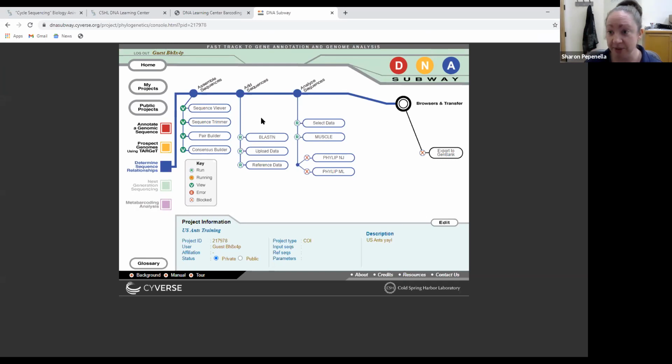Now, we used to be able to connect to, I should say we tried to connect to GenBank in real time, but you can imagine how large that database is. So that took quite some time for us to do an alignment through our servers here. So what we now do is we pull in a subset of samples from GenBank that's very similar to the types of samples that we search for.